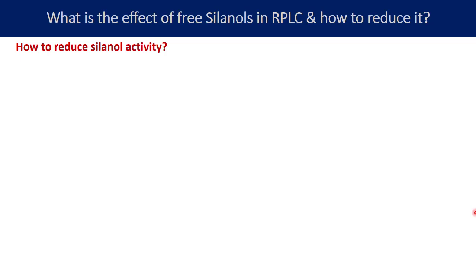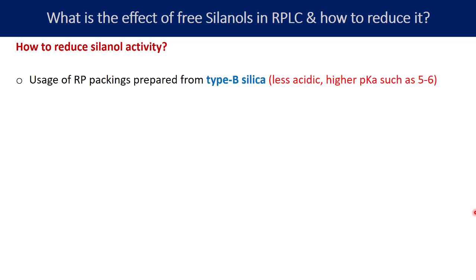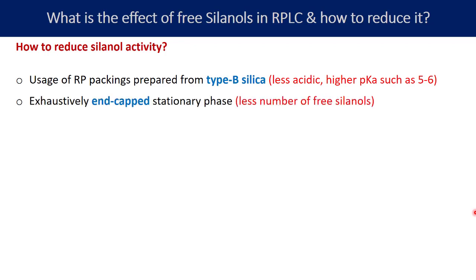How to reduce silanol activity? First, use Type B silica for manufacturing bonded silica columns. Type B silica is less acidic, with a pKa of around 5 to 6, and hence has less ionization at lower pH. Second, exhaustively end-capped stationary phases can help reduce silanol activity — end-capping involves adding smaller functional groups like trimethylsilane, which bond with the silanol groups, making them unavailable to interact with the analyte.